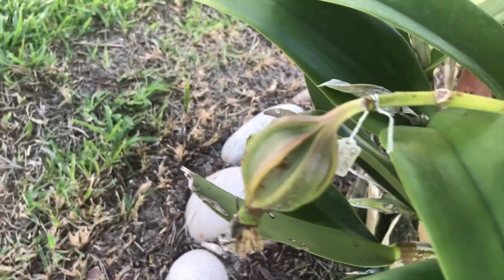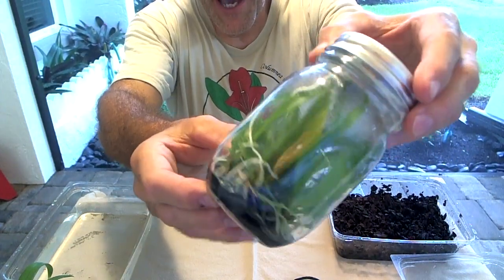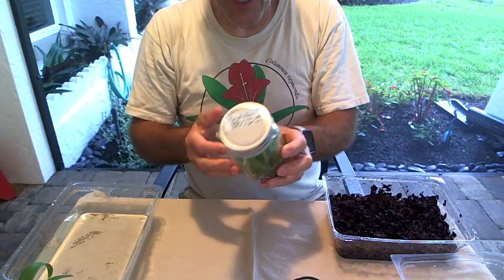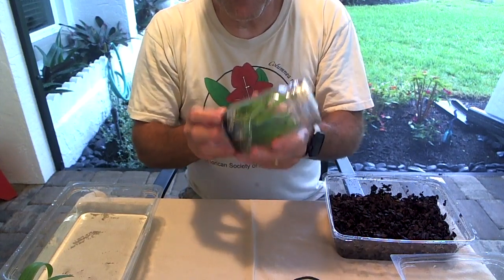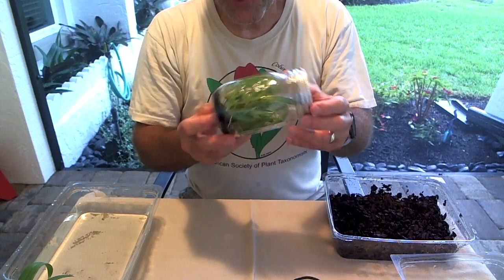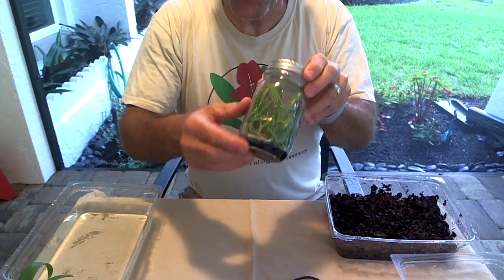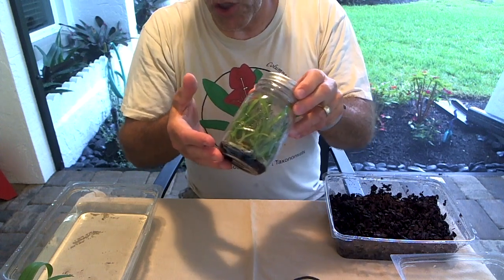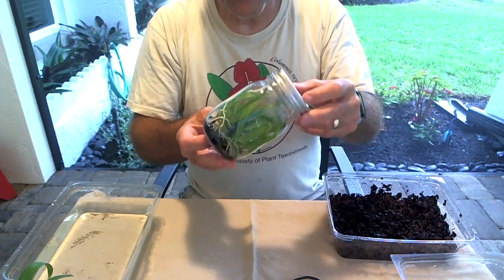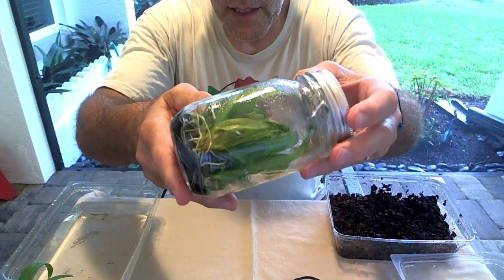But today what I want to go over with you is deflasking of these dendrobium orchids from this flask right here. Like I said, these have been in here for a little bit over a year. Normally I like to pull them out sooner, but these were just some leftover ones. What you need to know is these plants have always been in this flask, and in this flask there's a very nutrient-rich medium. The black is from activated charcoal, but it has minerals, nutrients, vitamins — everything the plant needs. And it's also very high humidity — close to 100% humidity in here. You can see some condensation on the side of the flask.